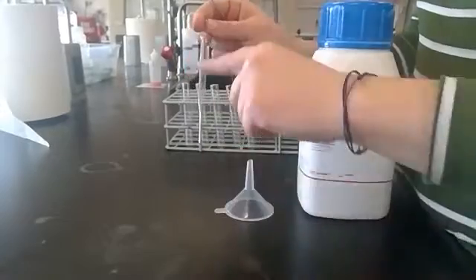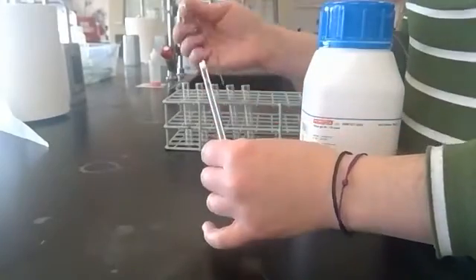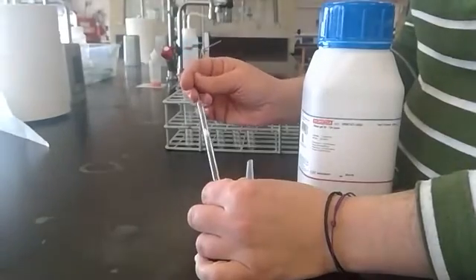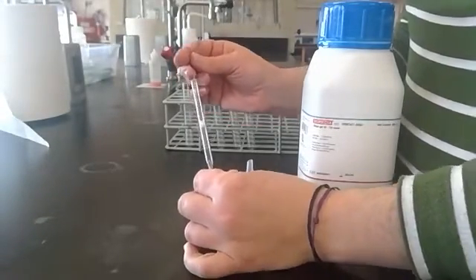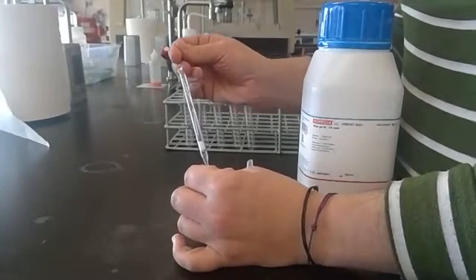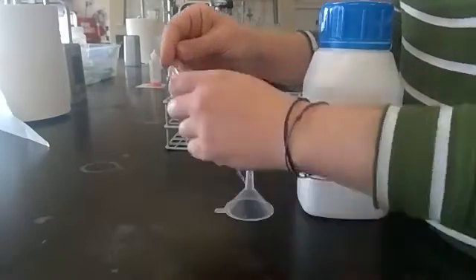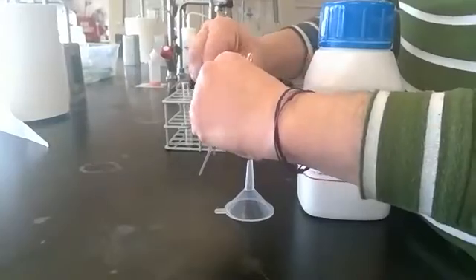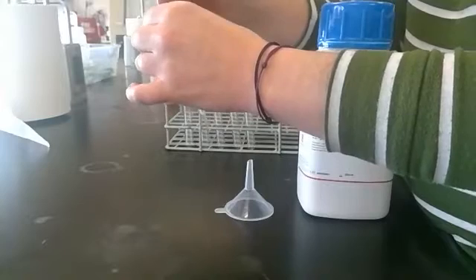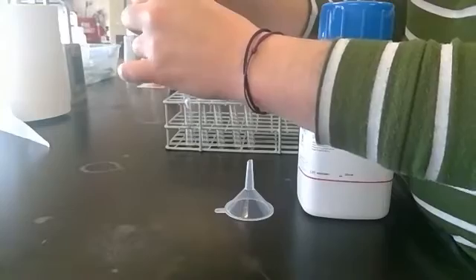And we're going to do that using a glass pipette. I have a little piece of cotton here that I just pulled off of a cotton ball. And I'm going to use a cleverly crafted paper clip. And I'm going to try to push this down. And I'm putting this cotton in here just to create a base so I don't have my silica gel fall out. And so it's just kind of like a little plug. So that way the silica gel has a kind of a landing spot. But all of our compounds will be able to go right through it.